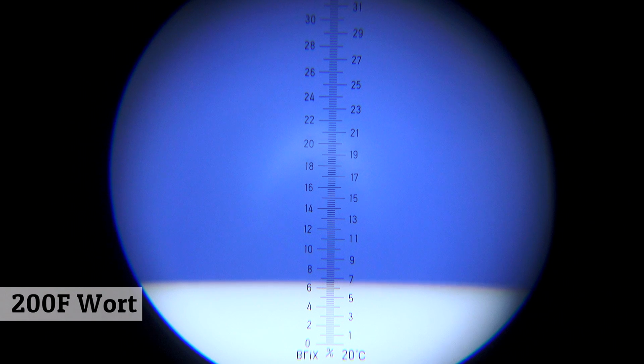We started about 6.5, and we can see that same behavior of the line moving upward gradually. That's just evaporation taking place. So that's a good thing to know, that looks like the initial reading might be the most accurate. So right when you put it on that platter, make sure you're looking through it, because it does seem like at that temperature it's wanting to move somewhat quickly.